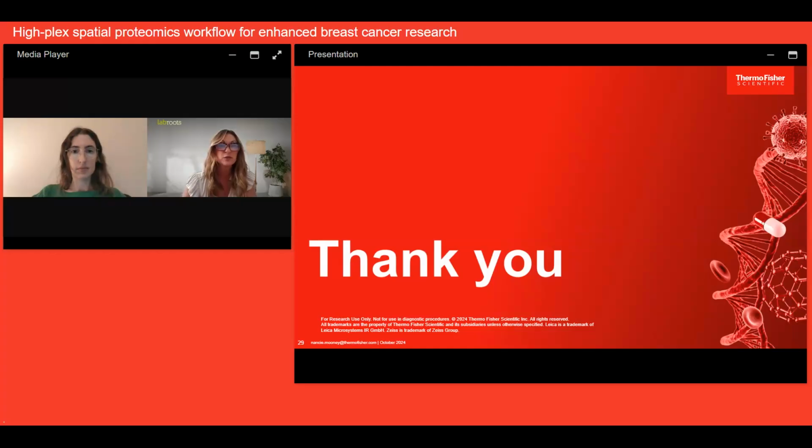Is there a difference between Alexa and Aluora dyes, the TSA versions? Sure. SuperBoost is our TSA, the Alexa-based tyramide amplification. Those were best optimized on cells. The Aluora spatial amplification reagents, we were using that to really optimize for tissue and bigger multiplex.